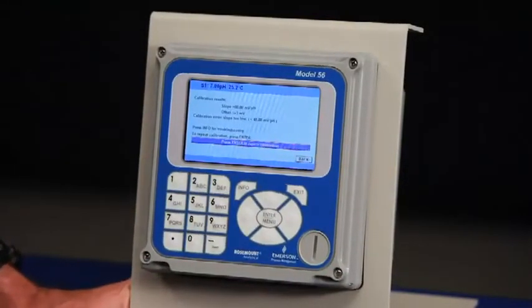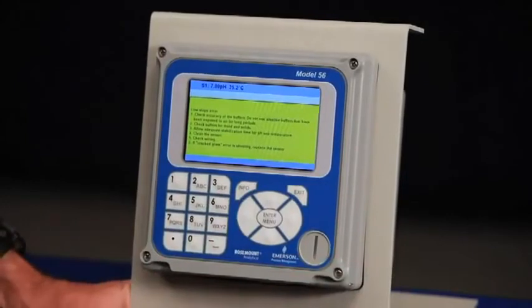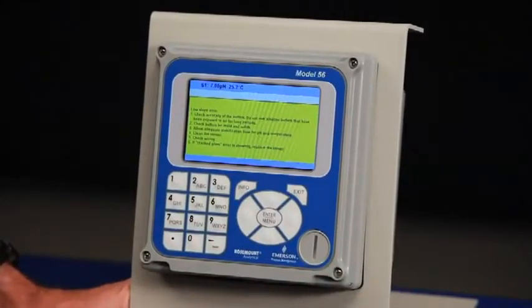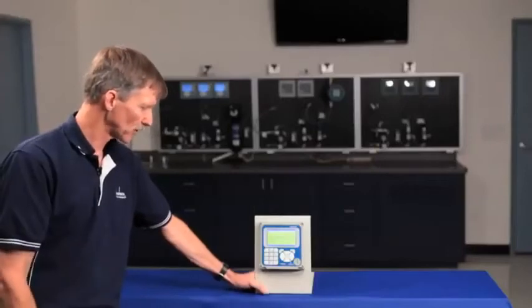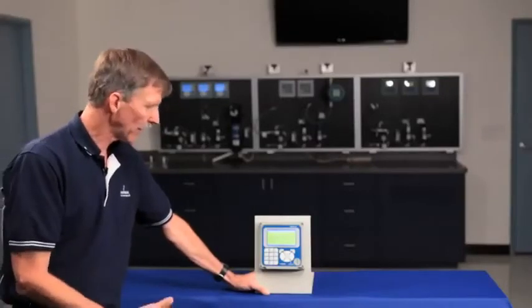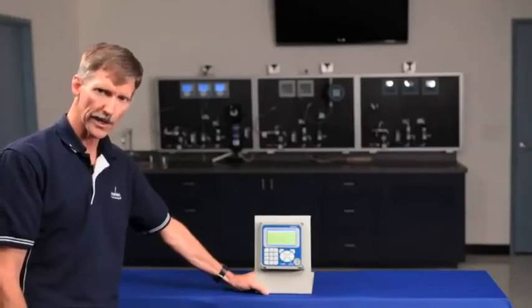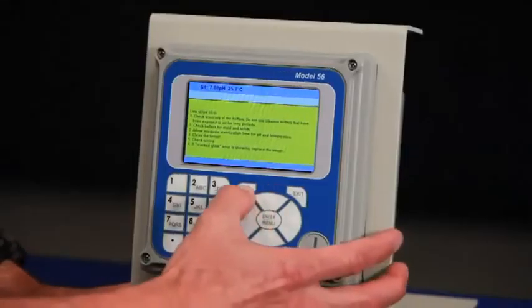At any point during the calibration routine, the technician can push the information button as a troubleshooting screen. And in this case, I'm displaying a screen that shows advice on how the technician can resolve a problem that was actually detected during the calibration.